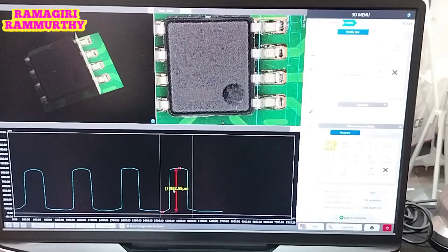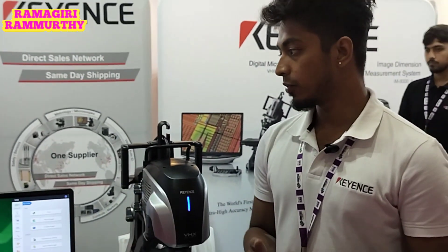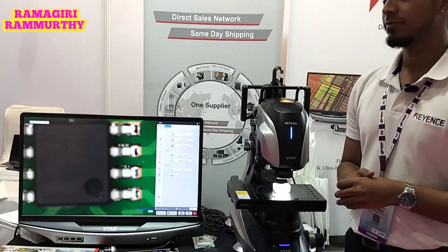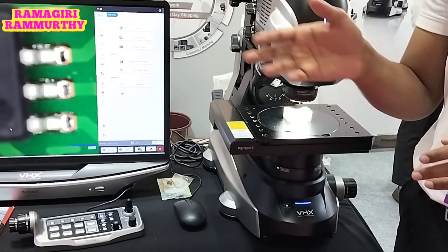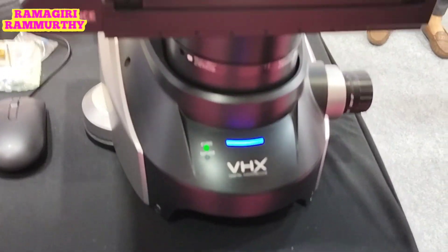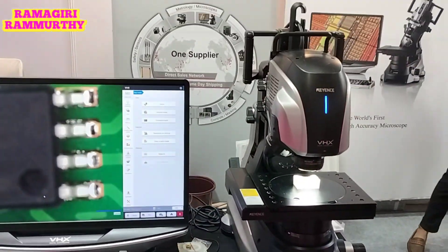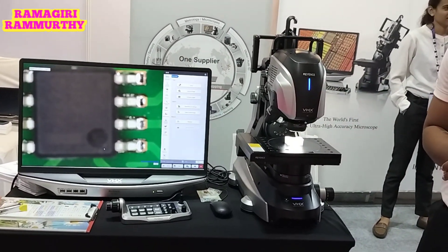So these are a few of the functionalities of the VHX. Which kinds of industries use this? Automotive industries, electrical industries, and pharma industries. Keyence has a very large global presence and you can find us across major OEMs. Regarding the price, it will vary depending on the configuration — our price range is very vast, so we cannot share an approximate figure.